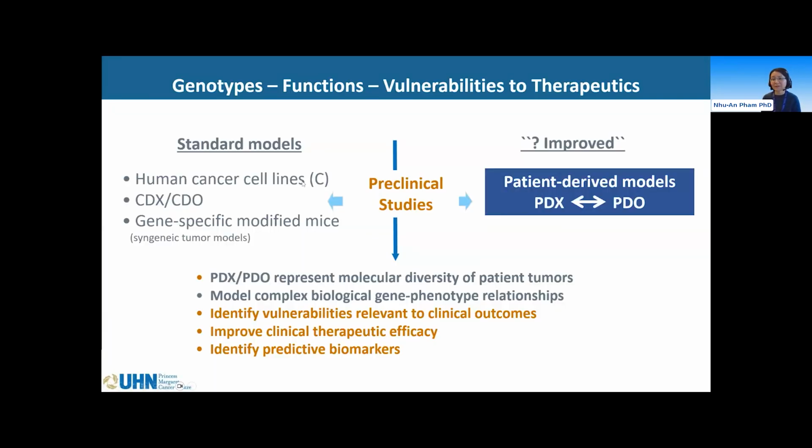So given the highlighted examples, to proceed forward, could we study molecular mechanisms of cell behavior using these more complex patient-derived models compared to conventional cell lines? We know that standard cancer cell lines in preclinical drug testing fail to predict clinical outcomes over 80% of the time. So evidence is accumulating for the utility of these new patient-derived models, but more study is needed on larger numbers of models with consensus on standard operating protocols. Next, I would like to share with you some of our PDX methods for study design.